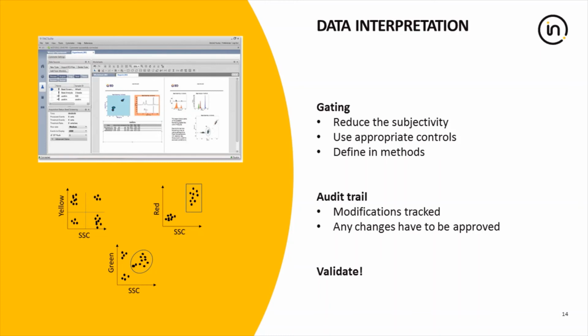If different analysts will be interpreting the data, it might be worth including inter-analyst data processing as part of the validation parameters. This is particularly the case if data processing involves subjective assessments. Wherever possible, the scope for subjective assessments should be reduced, and this goes right back to the importance of the development stage and including appropriate controls in our assays.